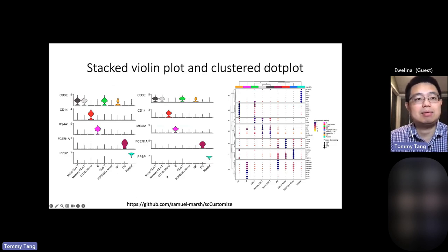Lastly, I want to show you two really cool plots in single-cell RNA-seq analysis: a stacked violin plot and a clustered dot plot. The Seurat package has a violin plot, but it does not have the stacked version, so I implemented this function. Both functions are incorporated into this R package called SC Customize.